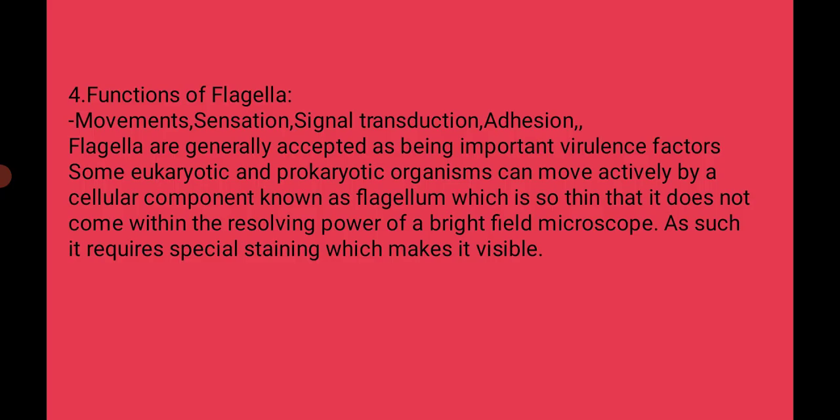The functions of flagella: for motility or movement, sensation, signal transduction, adhesion, and the flagella are accepted as a virulence factor. As the flagella are a virulence factor, they increase the pathogenicity of the bacteria.